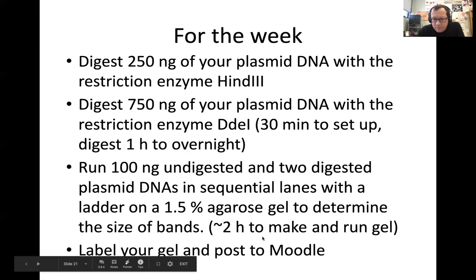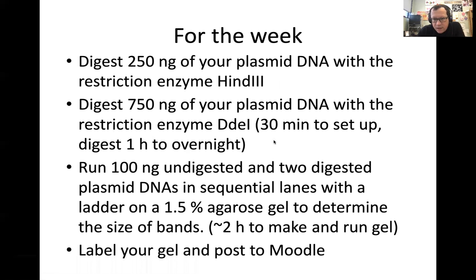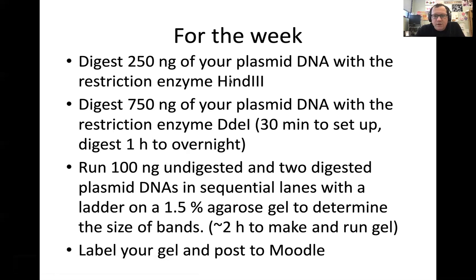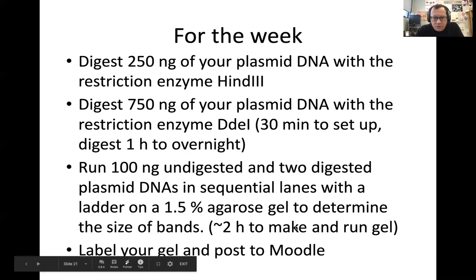Theoretically, you could make your gel and have it starting to cool and solidify during this 30-minute incubation. So if you wanted to do it all in one session, once you set up your restriction digest, there's no reason to wait this whole 30 minutes. Start making your gel now, let it solidify and cool. And then, it'll be ready right after that 30 minutes to run your gel. So it's a way to sort of optimize your time, and thinking about time optimization in all these different protocols is something that's going to come a little bit more naturally the more experience you have doing it. But if you want to take more time and do them separately, that's totally cool too.